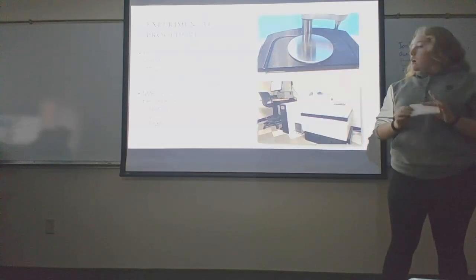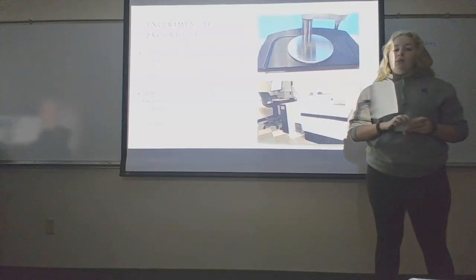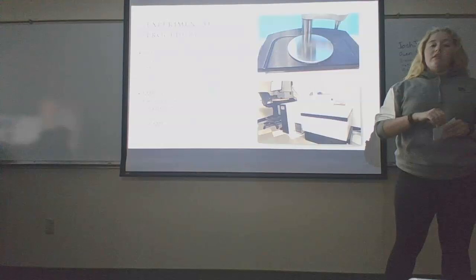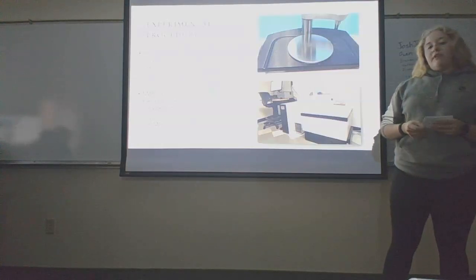and then our results were printed from the computer. For the NMR, our designated vial was taken and put into the sample adjustment block. After we did that, we took a VWR tissue and wiped off possible fingerprints. From there, it was put in the sample compartment and then the spectra was run and our results were printed from the computer.